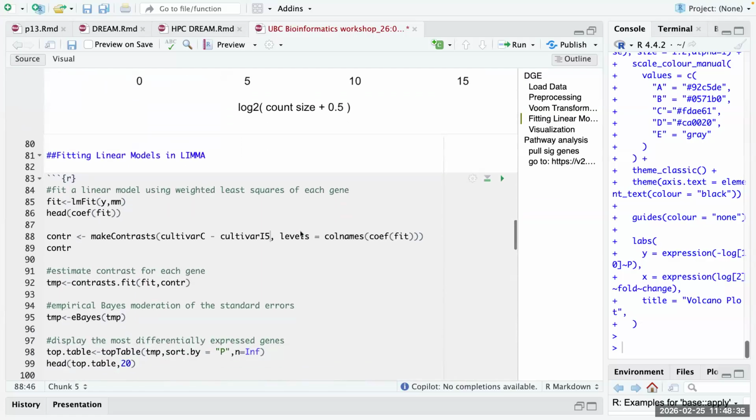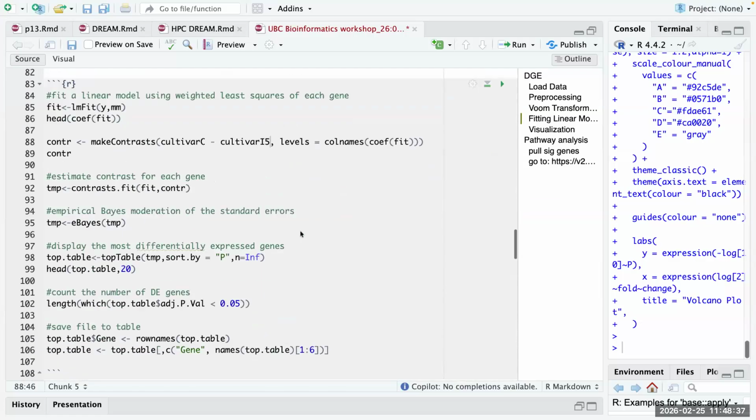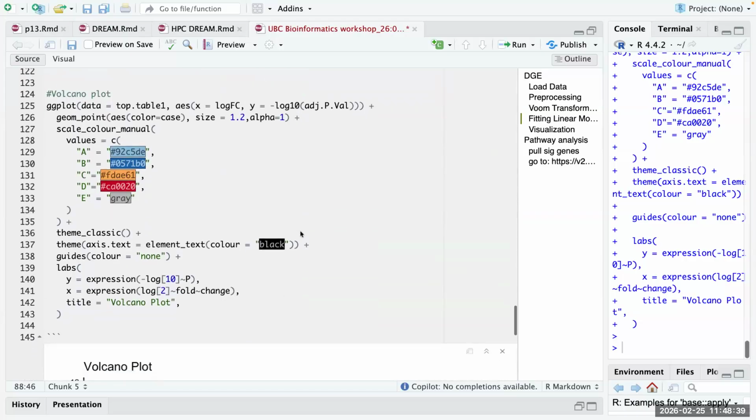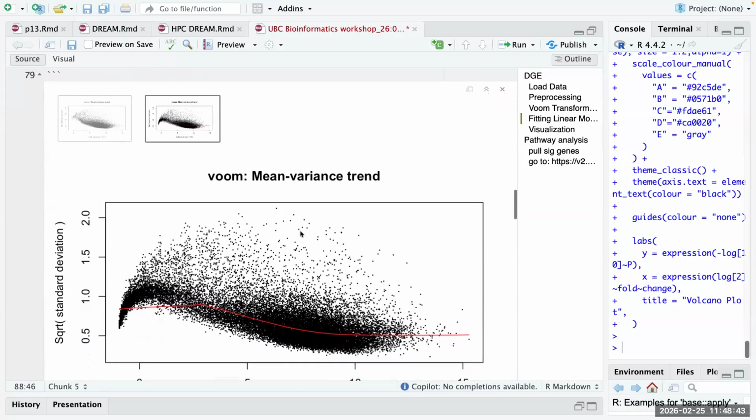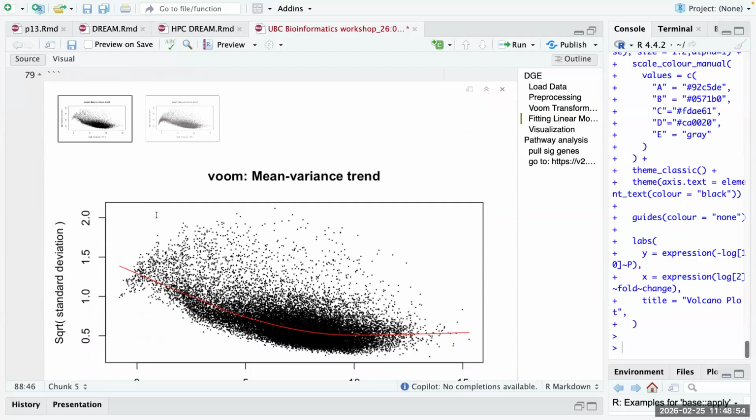Oh, you want to look at the typical one, here? So the shape here is not smooth. No, that is a bad example. This one is a good example. Okay, great. Any more questions?